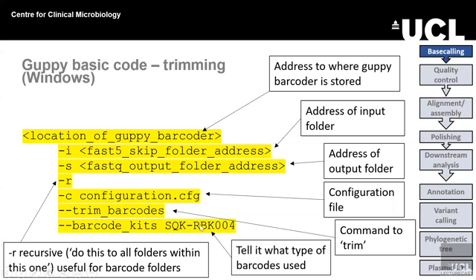As I mentioned, I use the Rapid Barcoding Kit 004. If you don't tell it which kit to use, and this is more important when you demultiplex, it will automatically search for 96 different barcodes, because there is an extension pack that has 96 different barcodes.